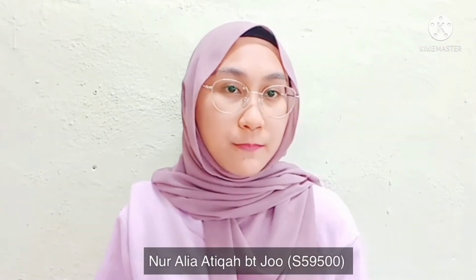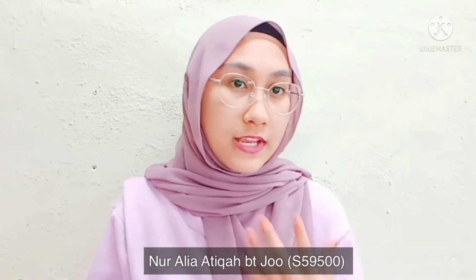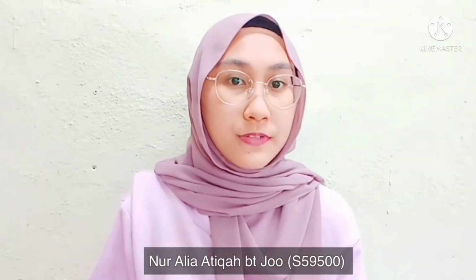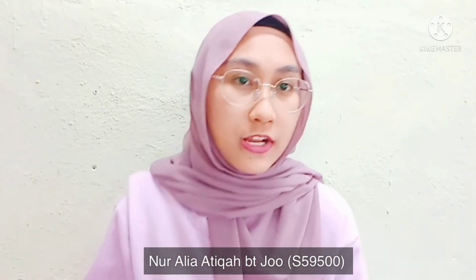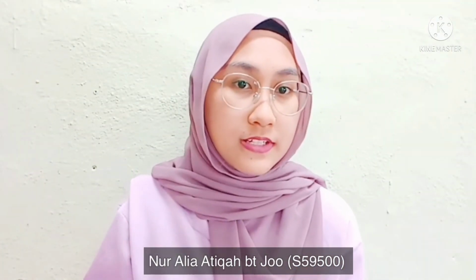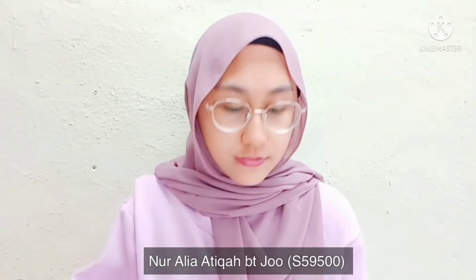For the experiment procedure, the first experiment is preparation of cyclopentadiene. First step, we put 40 ml of dicyclopentadiene into the 100 ml flask. Complete the setup with a fractional distillation column, Vigreux column, and condenser for distillation.